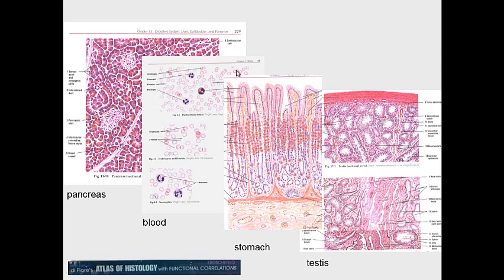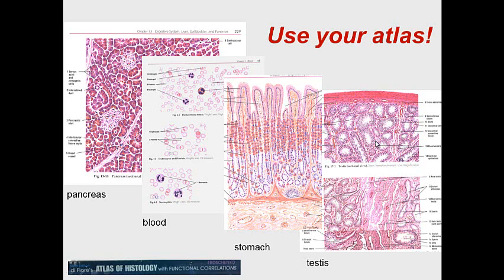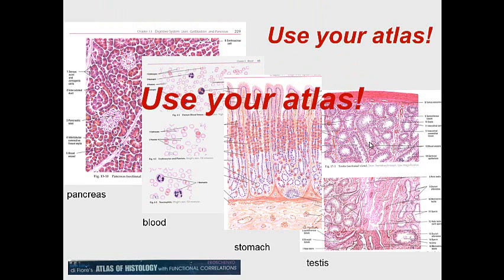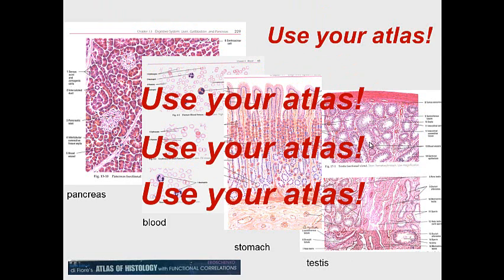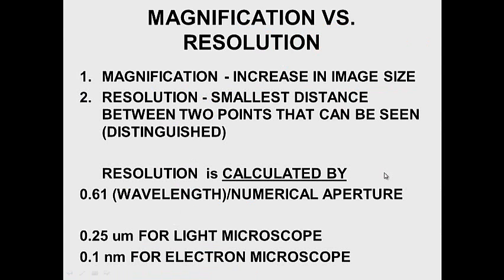These are the four basic specimens we'll be looking at today. First, the pancreas - we can see pancreatic acinar cells that produce pancreatic enzymes, and the lighter staining islet cells that produce insulin. Second, blood cells - eosinophils, neutrophils, red blood cells. Third, the mucosa of the stomach with parietal cells and chief cells. Fourth, the testis, showing cells in the tubules and Leydig interstitial cells in between. Use your atlas to observe and identify these labeled structures.